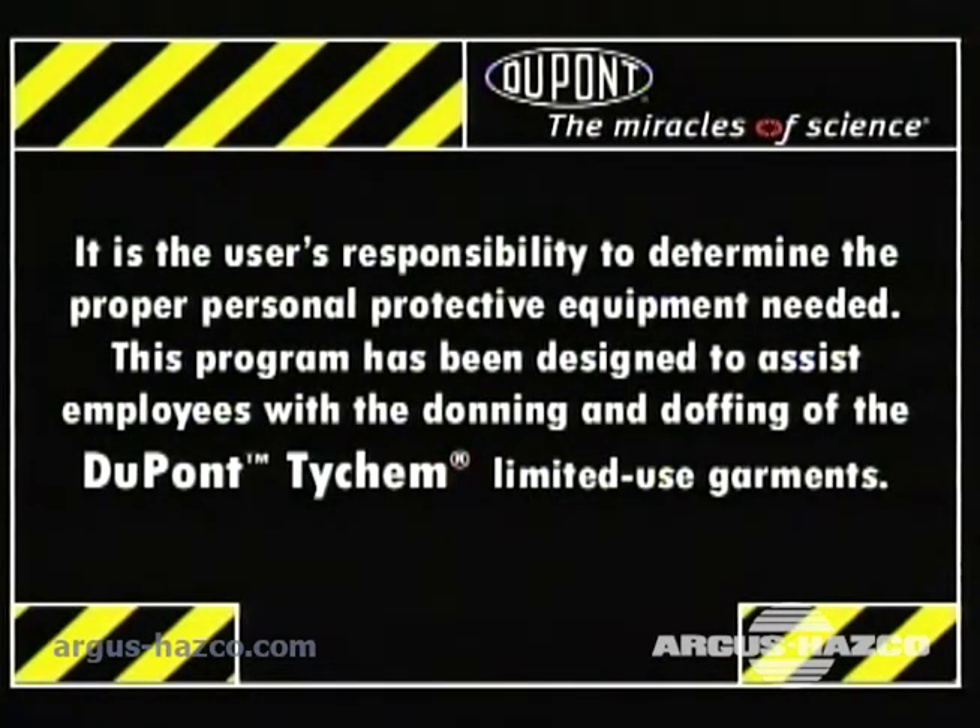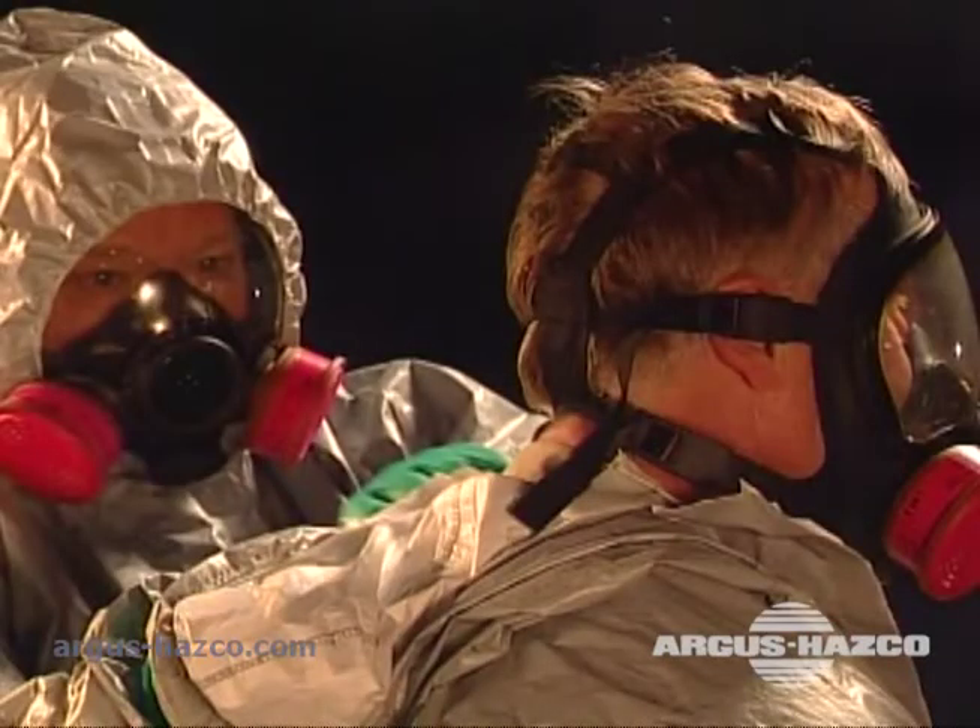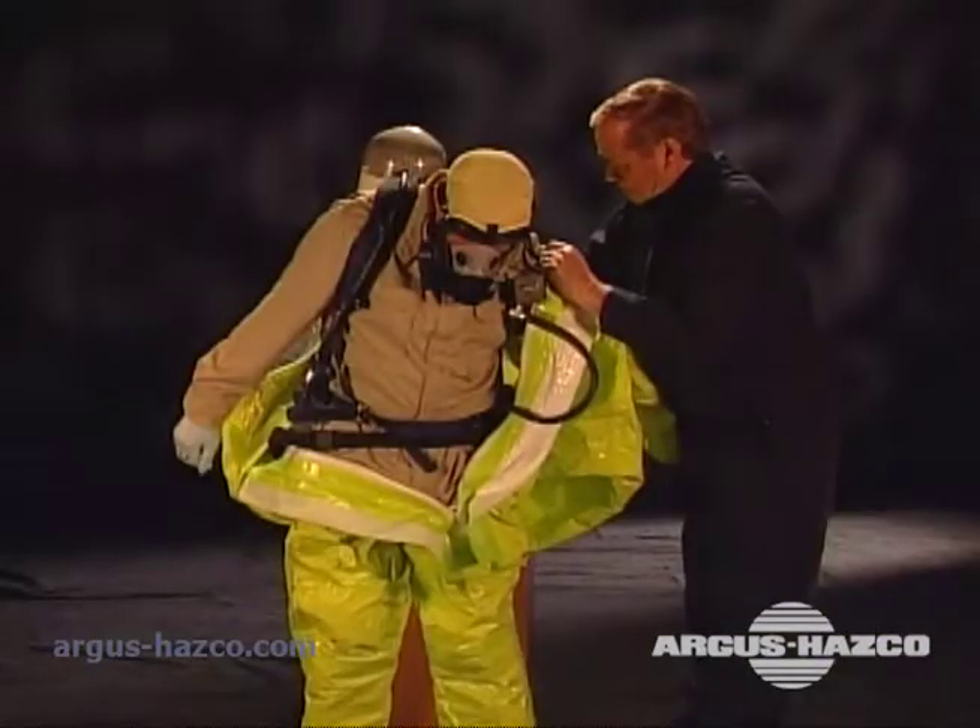Remember, it is the responsibility of the user to determine the proper personal protective equipment needed. This program has been designed to assist employees with the donning and doffing of the DuPont Tychem limited-use garments. By following these step-by-step procedures, you will get the optimal protection from these high-quality garments.